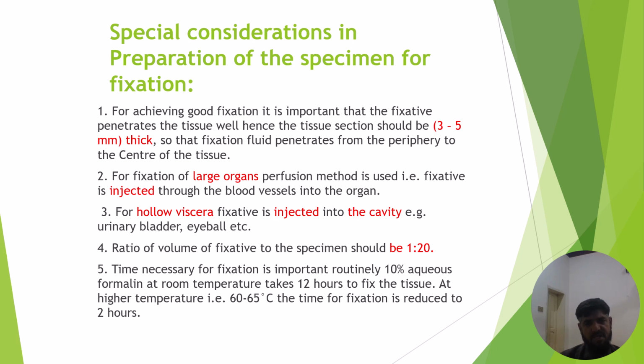The time necessary for fixation is very important. Routinely, 10% aqueous formalin at room temperature takes 12 hours to fix the tissue. At higher temperatures, that is 60 to 65 degrees centigrade, the time for fixation is reduced to 2 hours.